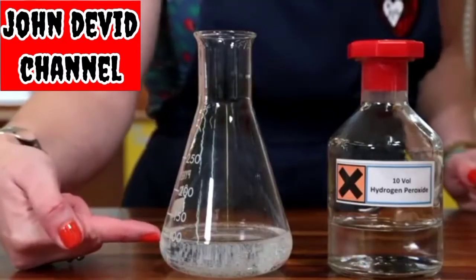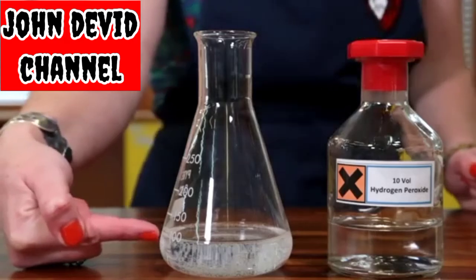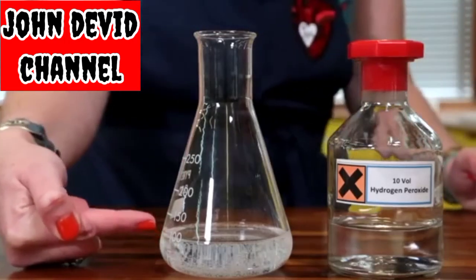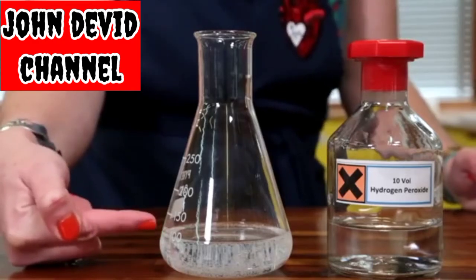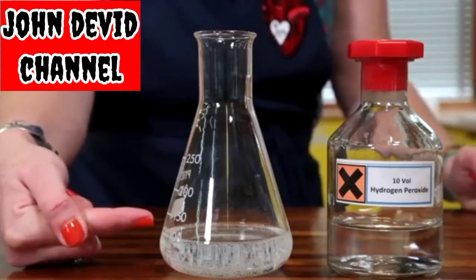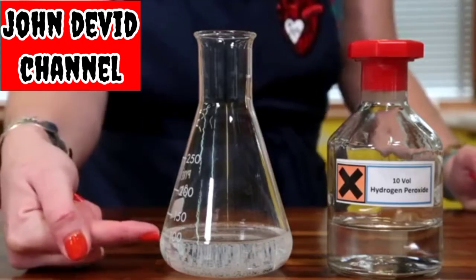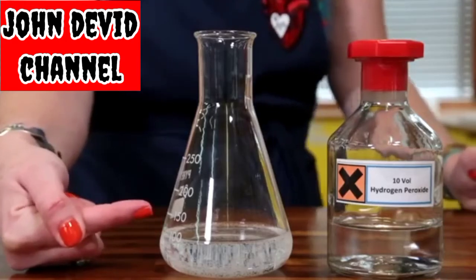In this conical flask we've got hydrogen peroxide. This is a chemical that's naturally produced in the body by the thyroid and the gut, but it's toxic. So one of the jobs of our liver is to detoxify this, and that's because the liver tissue contains an enzyme called catalase. The catalase reacts with the hydrogen peroxide and turns it into oxygen and water.